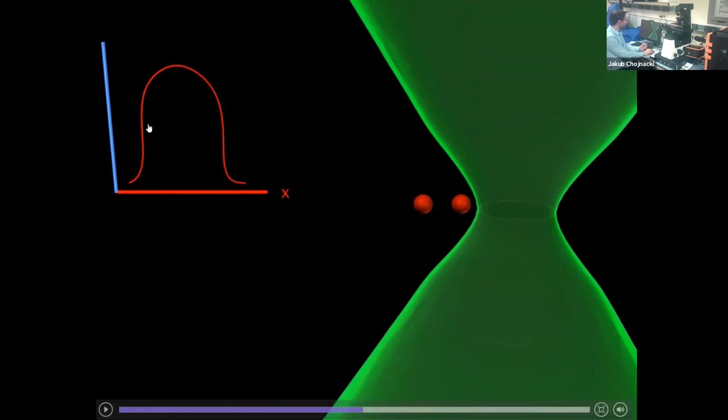And this is exactly where the resolution limit of a fluorescence microscope comes in. Because of the width of this laser focus spot, we cannot distinguish that there is some distance between those. And the signal that we're going to get indicates that there is just one fluorescent spot.